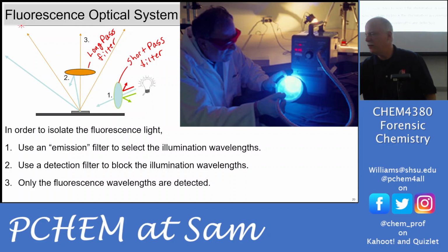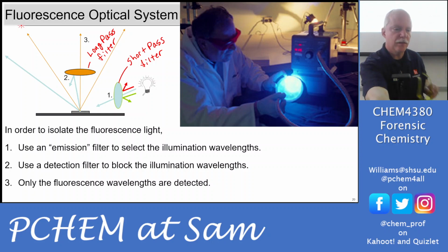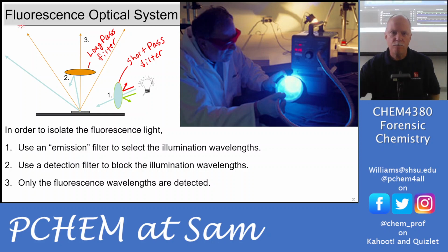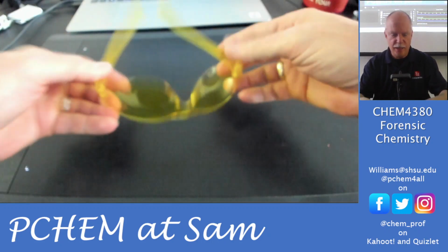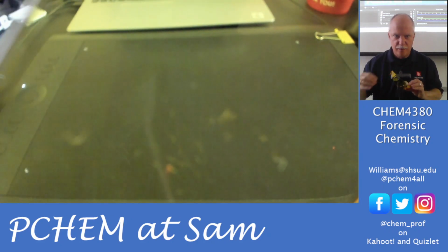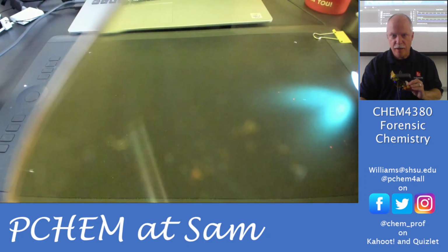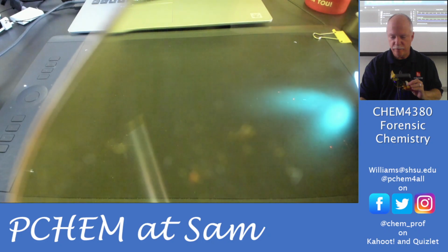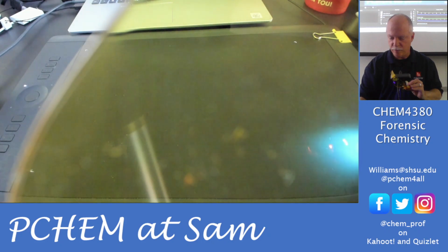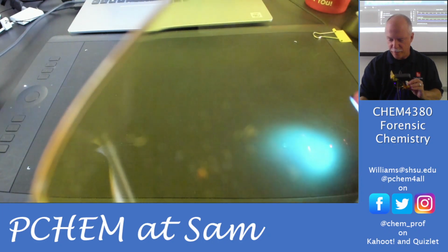Let me try to put a filter on our lamp here. All right, so we have these yellow glasses. We're going to block the light. I need to clean them, it looks like. Okay. And now that particle stands out even better. Okay, and this one too. Oh, I've smudged it. Look at that. Made a mess. It's probably on my hands now too.